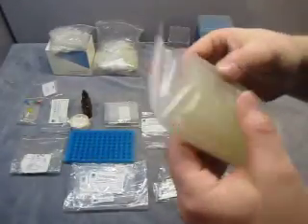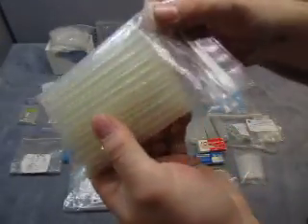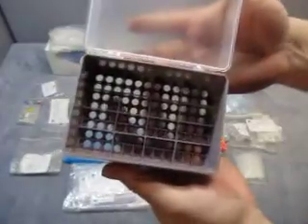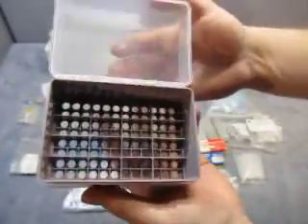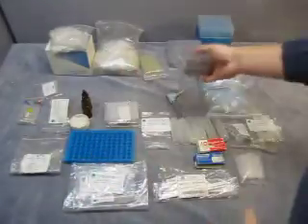Then you get some cylinders — they're like just covers or something, maybe probe-type covers. Two little boxes that hold something — there's 16 spots, and then six spots per thing that holds stuff, and there's two of them.